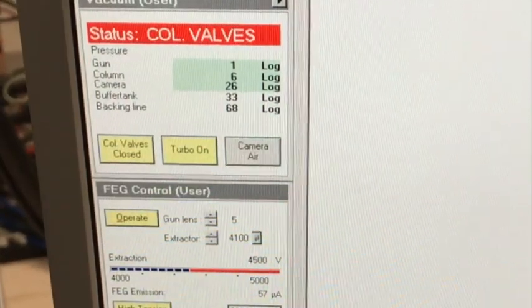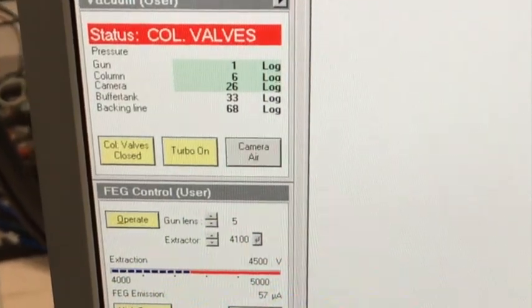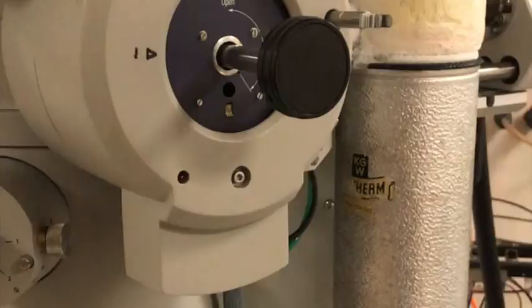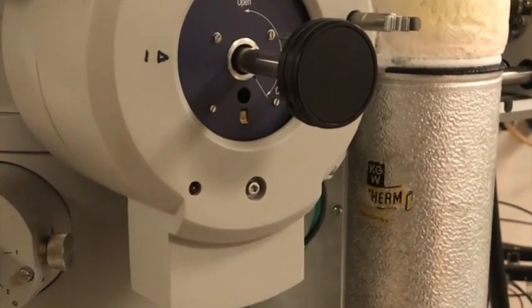You can see the timer disappeared from the screen and the turbo on button is active. Meanwhile, you will notice that the red light is turned off.